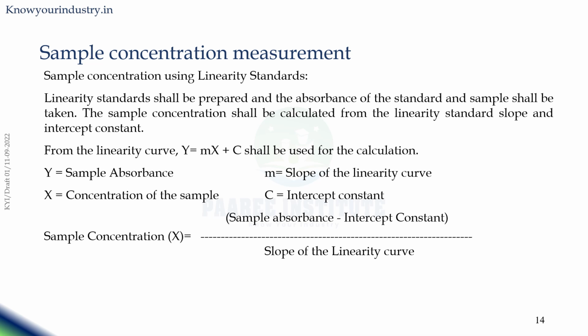Once the method is developed and the instrument is giving proper results for your samples, the obtained results will be used for the sample concentration measurement. The sample concentration measurement will be carried out by the linearity standard curve method. You have already done the linearity standard curve measurements, wherein the standards will give you absorbance against different concentrations.